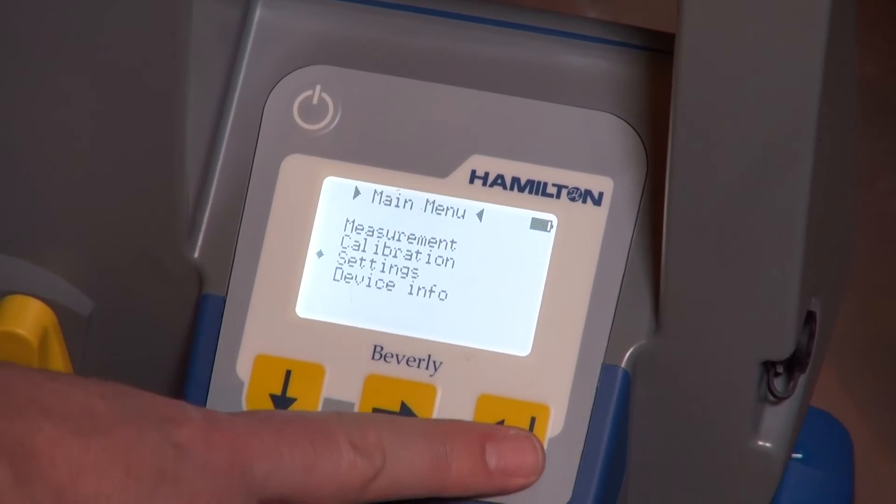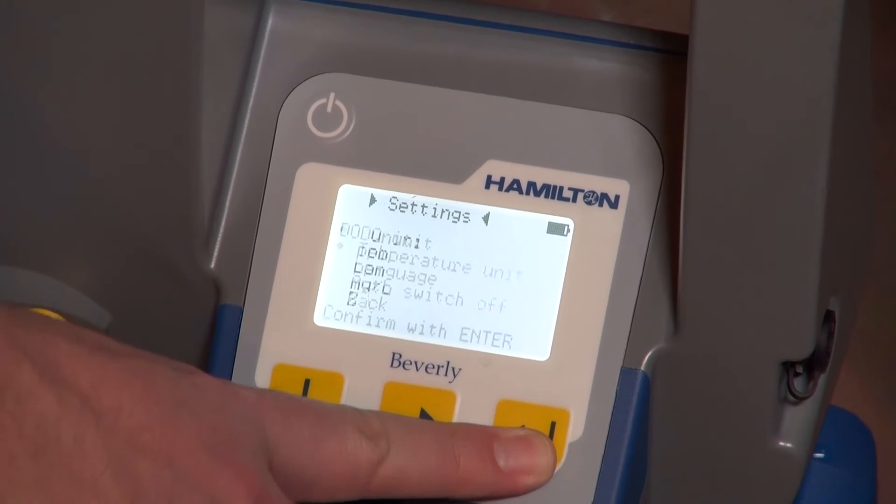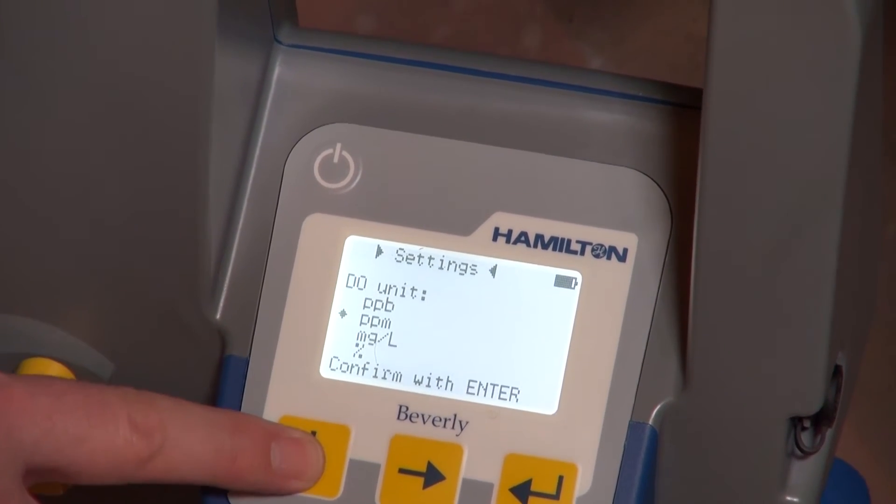The Beverly software offers easy-to-navigate menus for measurement, display, changing settings, and sensor calibration.